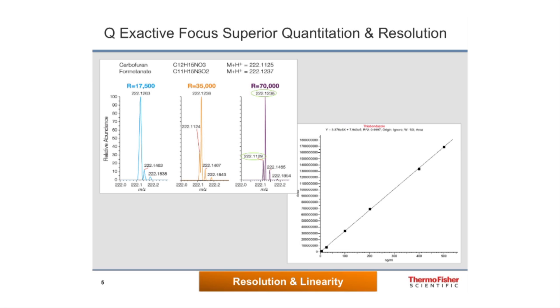Just a little slip in there, and you again don't see that flank here. And with 70,000 resolution, we clearly can separate these two components. As I said, it's made up. Of course, it's an example, but look into the data of high-res instruments. You will see that often enough.